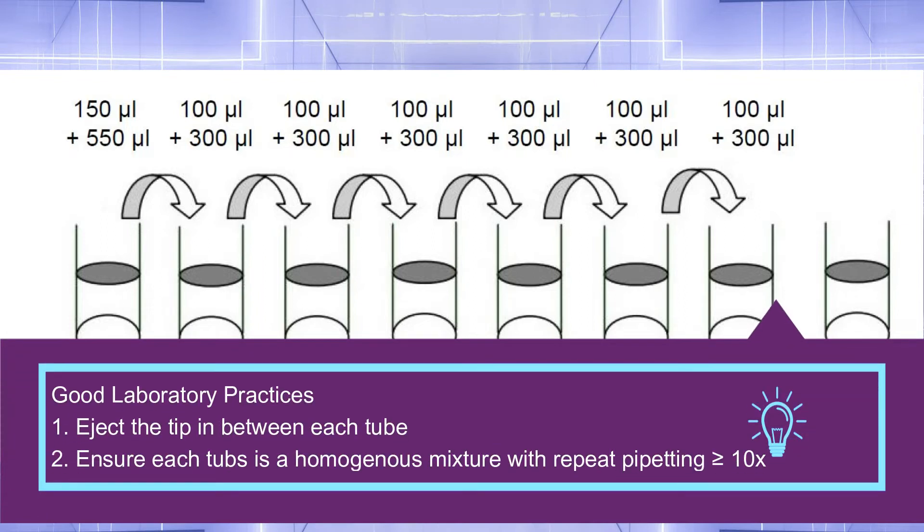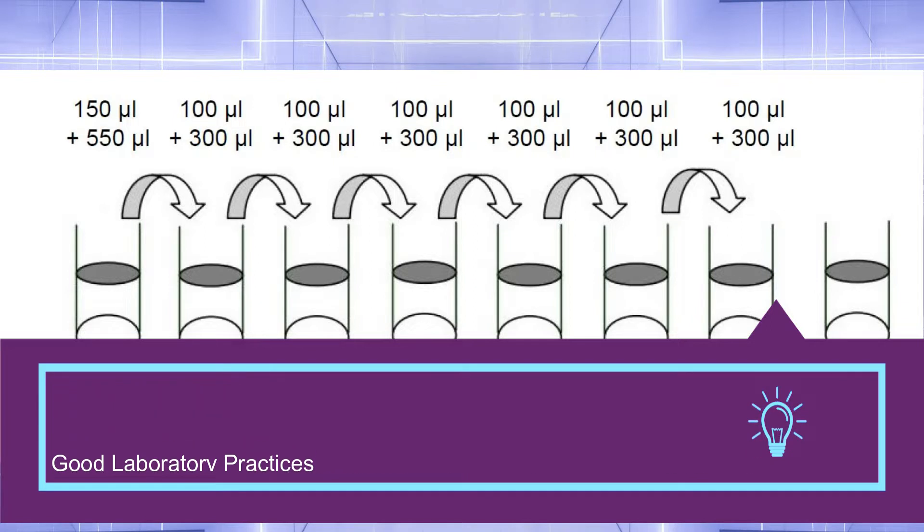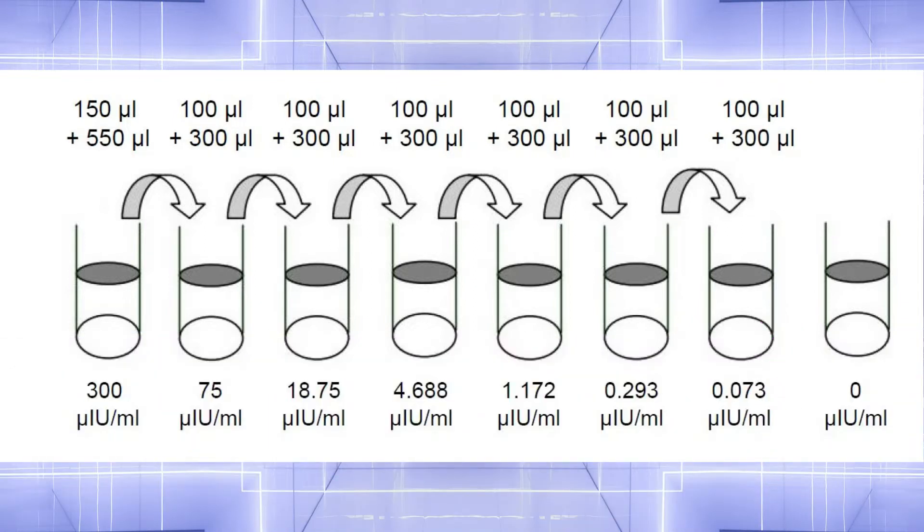When you perform this step, make sure you truly mix each mixture so it's homogeneous and eject the tip between each standard. This ensures we're reporting the correct concentration for the calibration curve. Don't passage any antigen into the zero. It's a true zero.